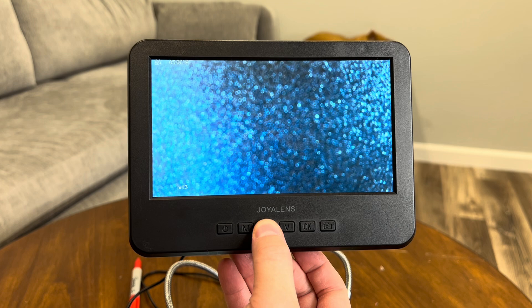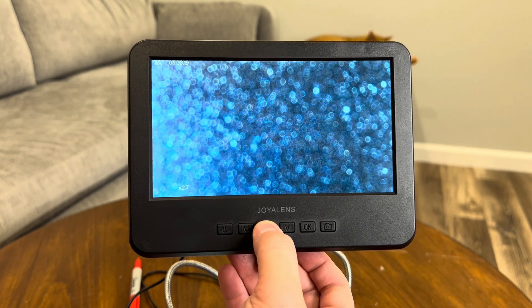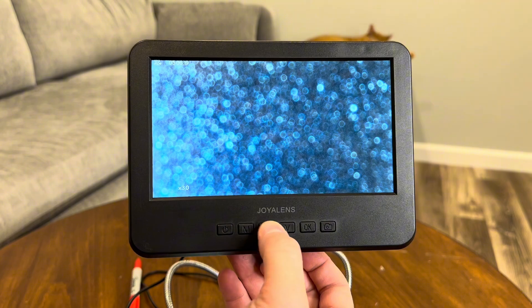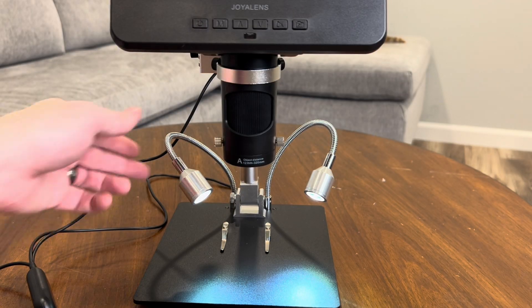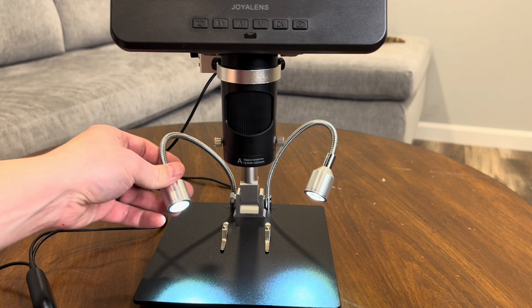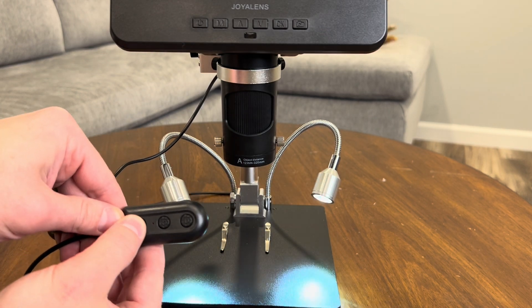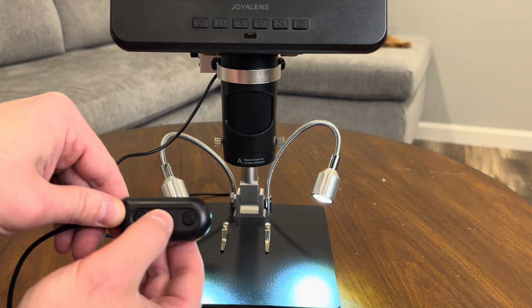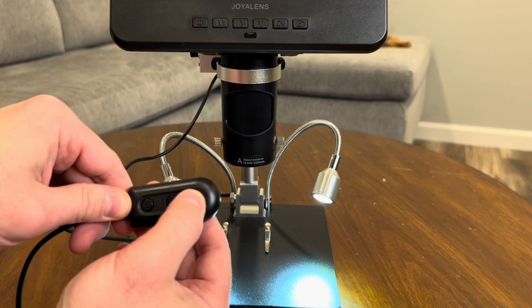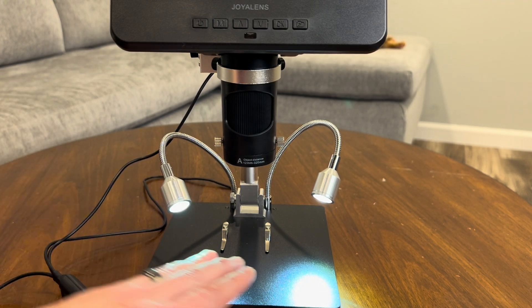One thing I really like is the digital zoom. The zoom works really well, and everything stays clear and focused even at higher magnification levels. Next up is the built-in LED illumination. There are two adjustable LED lights that you can easily control using the dimmer switch. This allows you to get the perfect lighting whether you're in a dim room or you need to highlight a specific part of your sample.